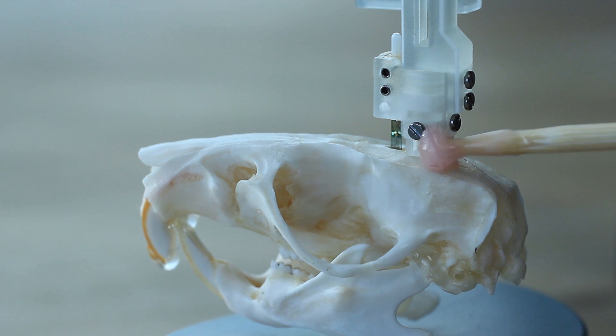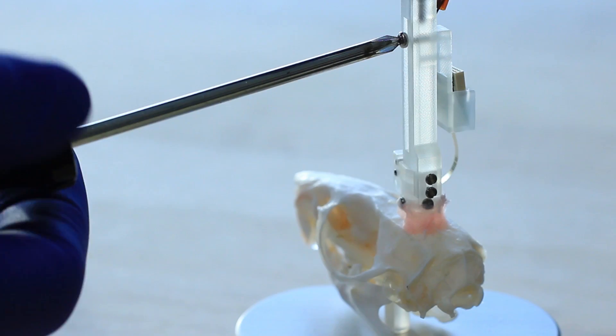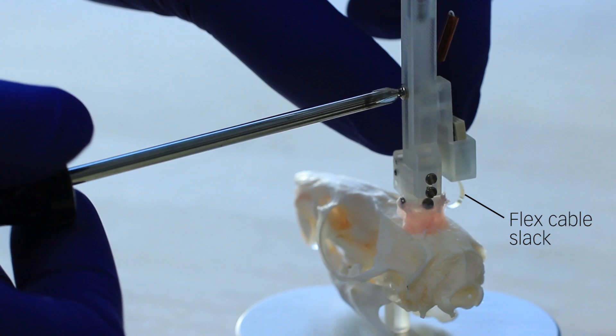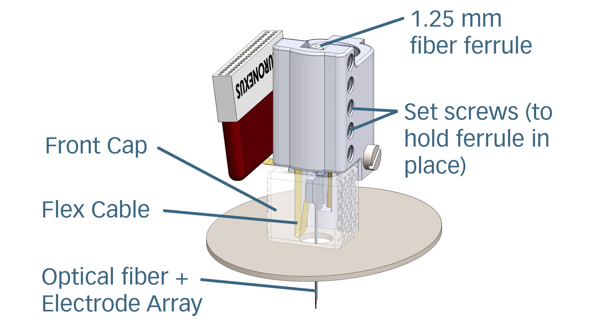Apply a small amount of cement to the back side of the O-Drive, being careful not to touch the electrode array. Create slack in the flex cable by lowering the connector holder. Please note that cable slack is required for the probe to move up and down freely.